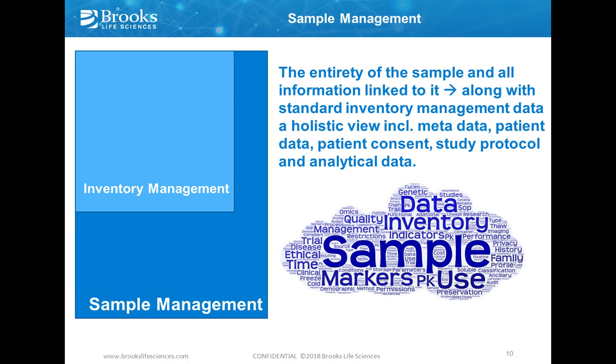But if we turn to sample management, it includes all of those things that we just talked about for inventory management, but then brings along with it all of the metadata associated with a sample. So whether that is patient clinical data, demographic data, family history, consent information, the primary study protocol under which it was collected, all of the methods used during the collection and preservation process, and then I think most importantly, actually, the analytical data that was generated from that sample, because as we do additional analyses and we start building data stacks associated with each sample, we're really unlocking the intelligence and getting maximum scientific value out of that, because we can leverage the information that has been previously learned for our future analyses.